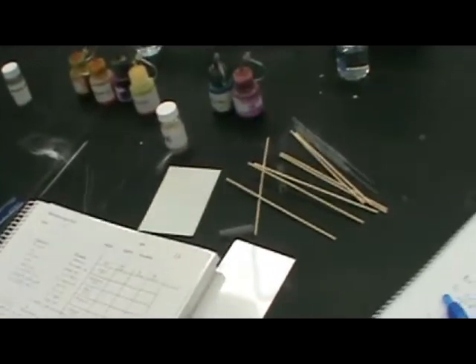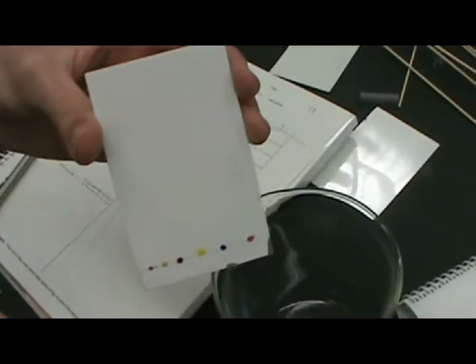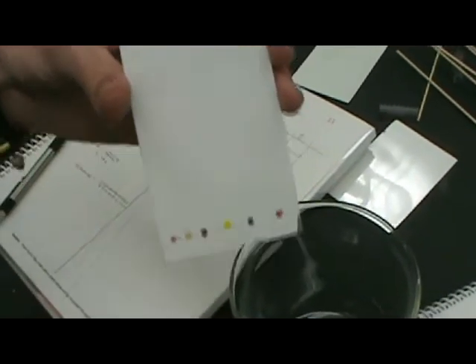And we put this in here. And we get some plastic wrap and rubber band. We seal this off. The mobile part comes from when these dyes will move up and we can identify different stuff, because that's what chromatography is, identifying stuff.